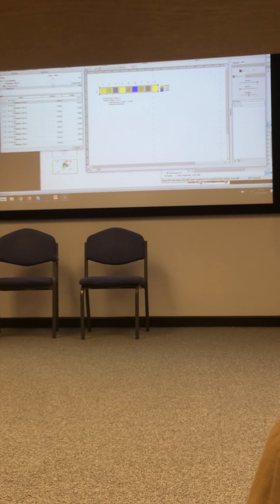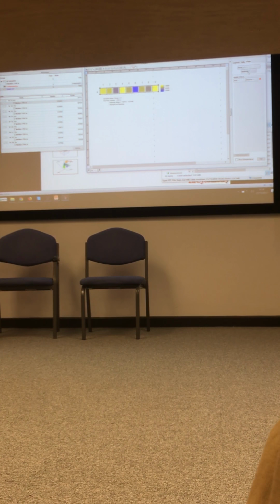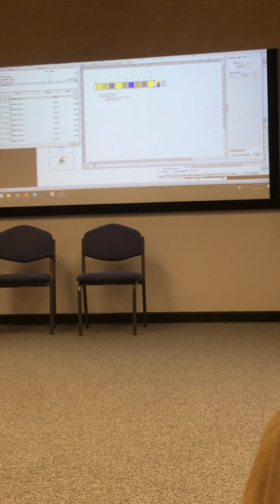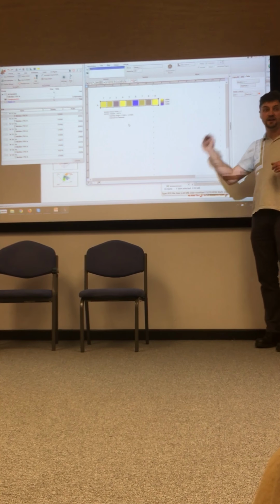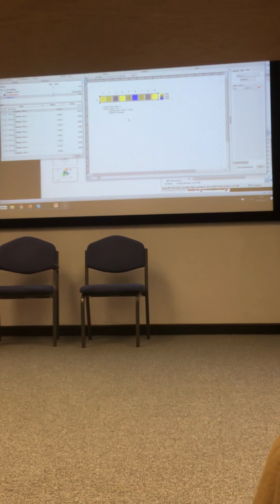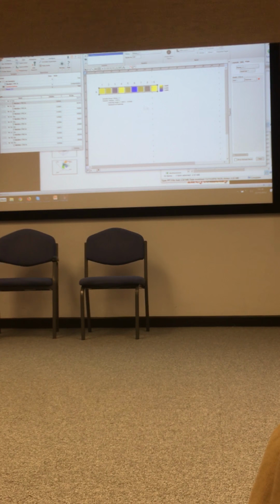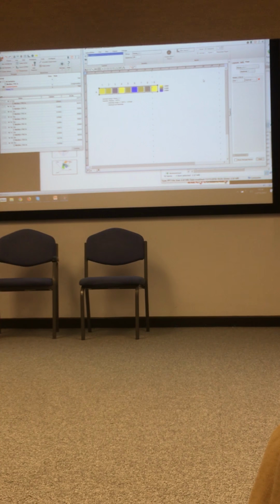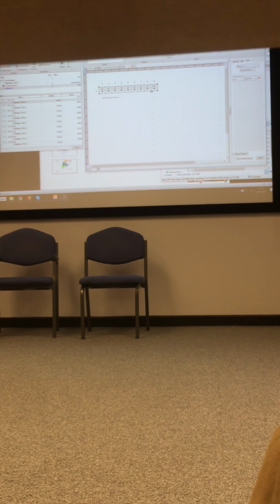It will also allow you to do two-way heat maps where you can put another parameter in, one parameter top left and another parameter bottom right, and the colour tells you how much of it there is. But that's only 2-dimensional data. If you want to do more than 2-dimensional, you have to go to this.